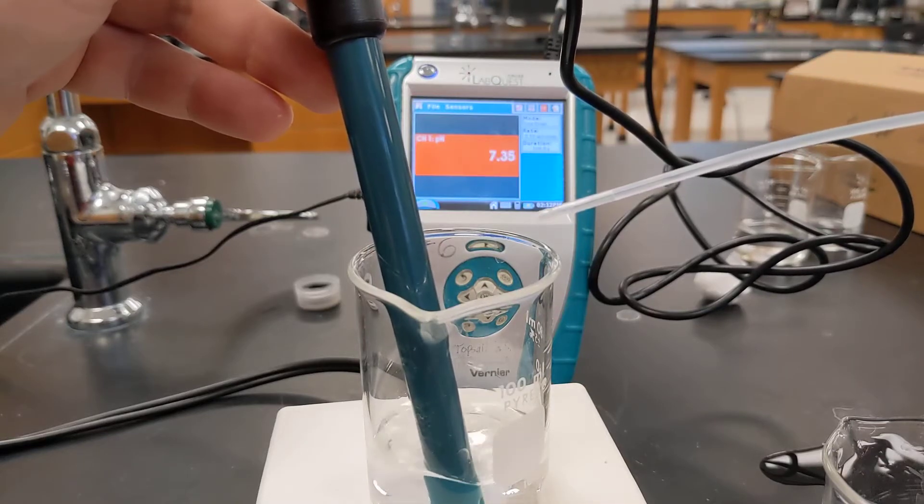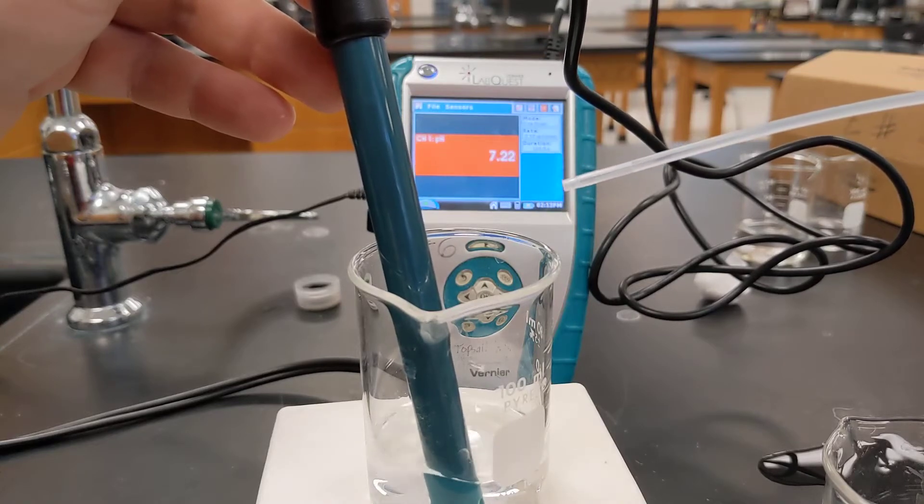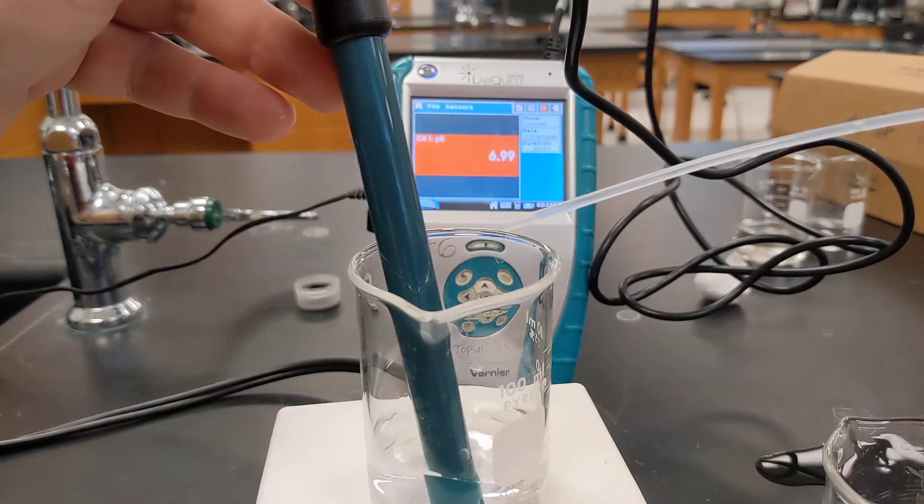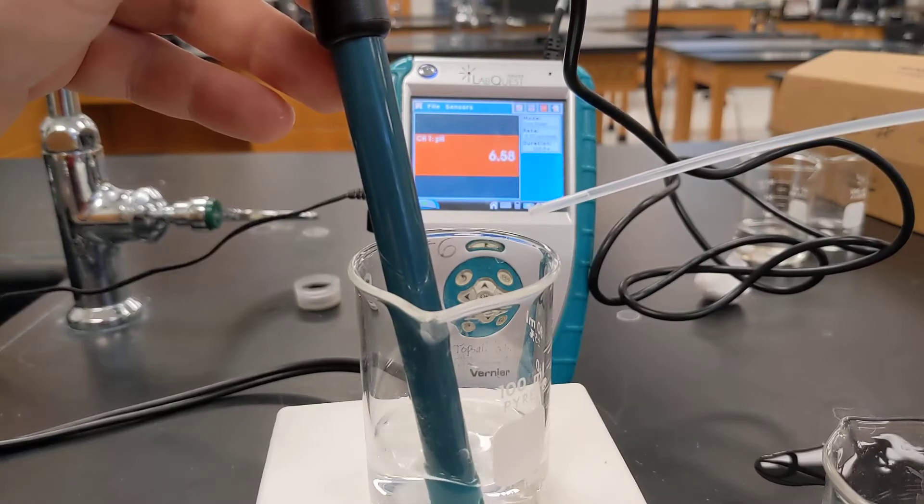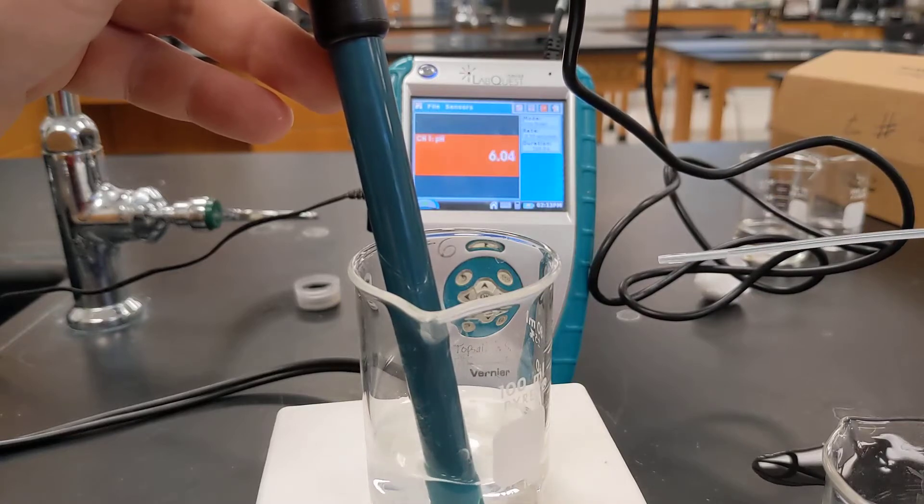Let's see, the pH is starting to go down. Let's add one more drop and get that in there. With two drops you can see the pH is really starting to drop now.